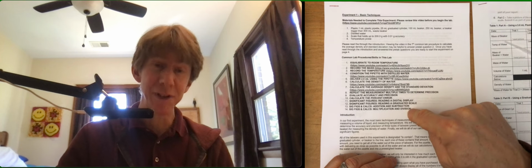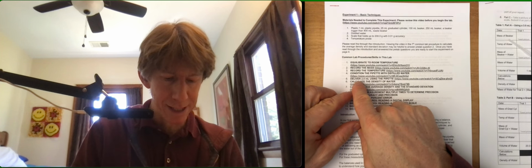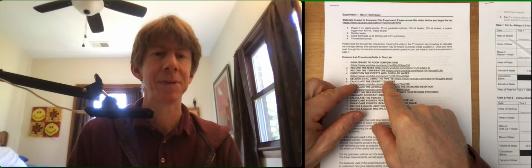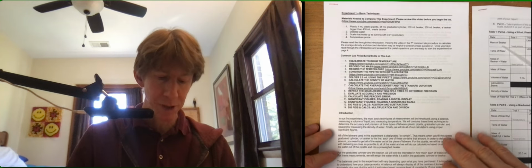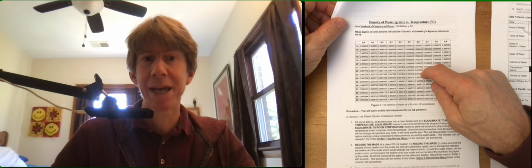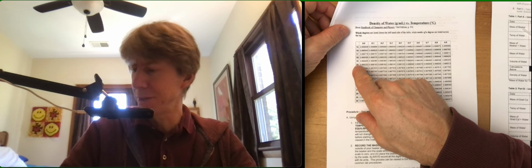There's also a number of videos that you can use to help you do this. The one thing I will point out is that we are going to be delivering 1 mL using the pipette. And one of the example videos is when the plastic pipettes were 3 mL pipettes and we had them deliver 2 mL. So small differences there. Let's go ahead and get to the actual procedure. Well, one other thing to point out is there's a big table of density values for water. We will be calculating the density of water and comparing it to these values. And you'll have to know what your temperature is.